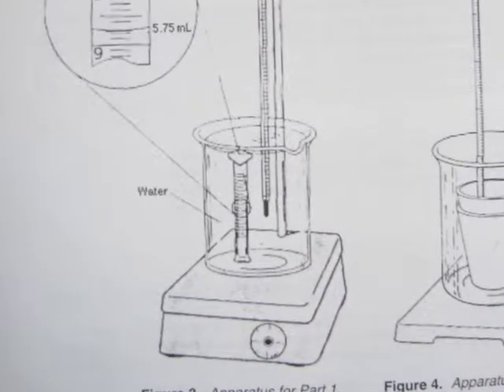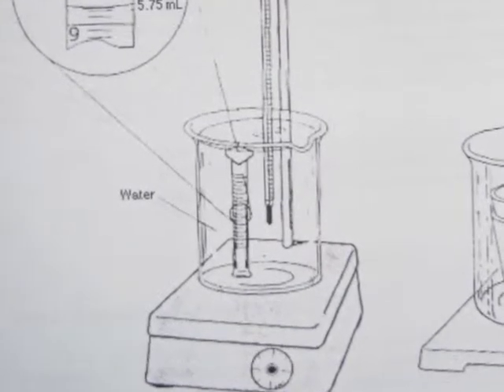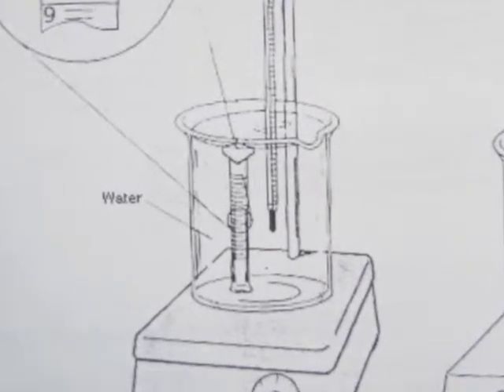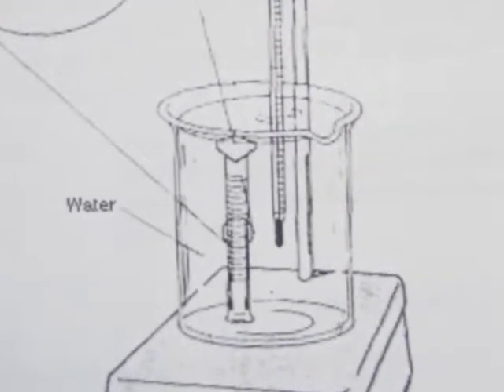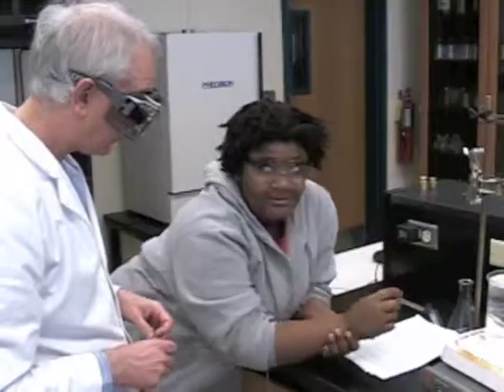First, I ask them for 2 reasons why the air bubble in an inverted graduated cylinder immersed in water gets bigger as you heat the water. Students explain as they are watching it happen in the apparatus they have assembled.